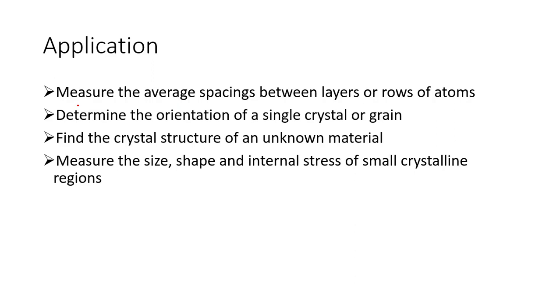The first one is to measure the average spacing between layers and rows of atoms. As we know, the crystal structure has an arrangement of atoms, and if we know the spacing between them, we can arrange them and use them for analysis, and determine the orientation of a single crystal or grain.